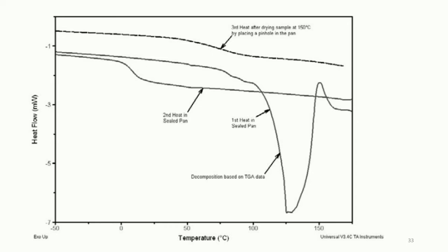The sample glass transition is seen starting at 50 degrees Celsius. Here we can see this is quite obvious in the third heat, ending near 100 degrees Celsius.